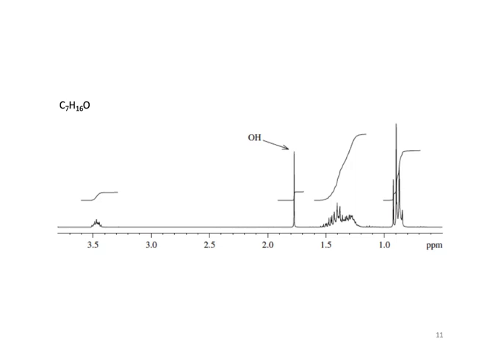All right, so this one looks more gnarly, probably because it's at 100 megahertz or something. What about unsaturations? 0. Okay, C7H. So what kind of functional groups could we have?